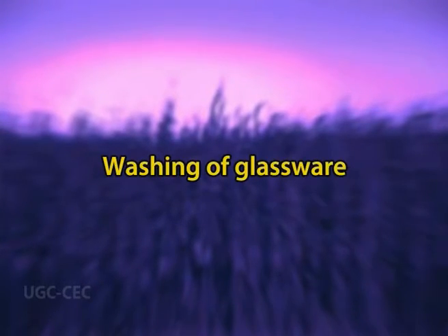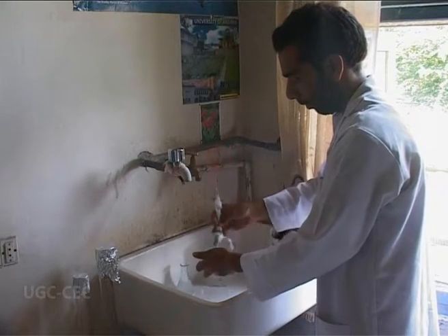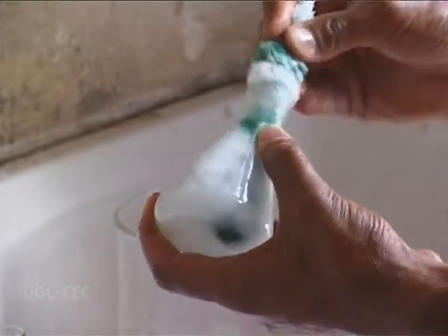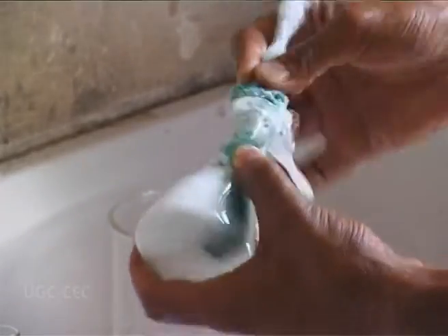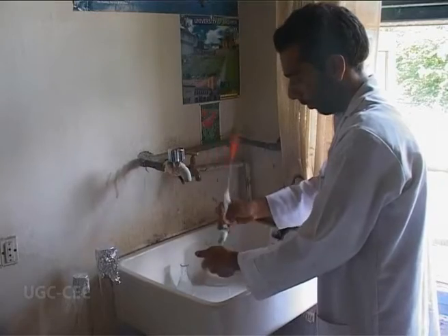Let us discuss the first important step of plant tissue culture technique, which is washing of glassware. All the glassware that is used in the process of plant tissue culture is soaked in detergent solution like Labolene for a suitable time duration, preferably overnight.